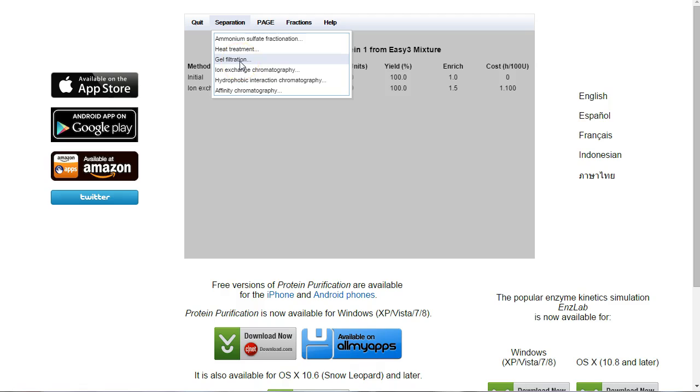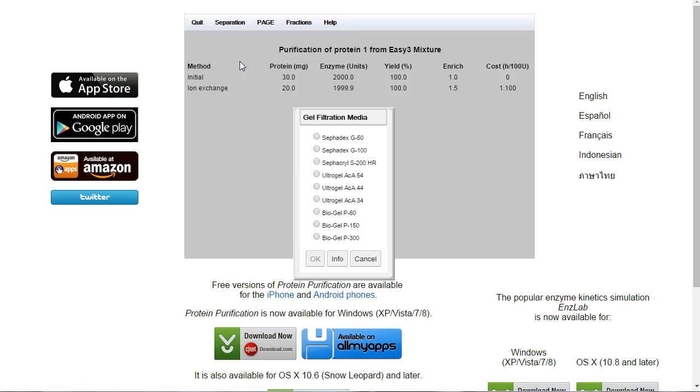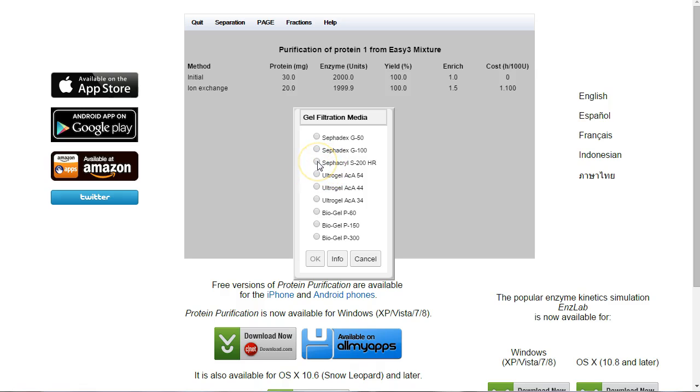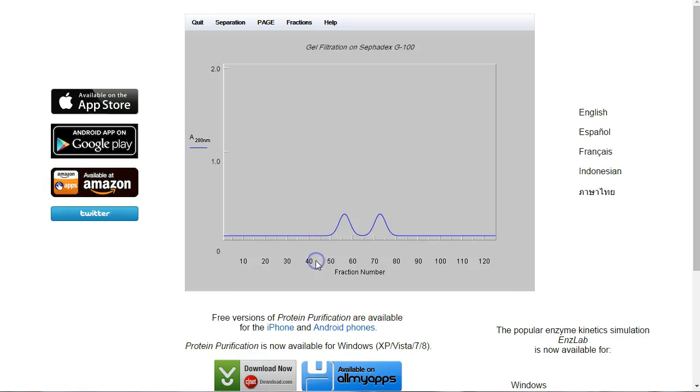Gel filtration separates on the basis of size. We need to pick one of these matrices to use. I know Sephacryl S200 is going to work. These ones all here will work. So let's pick G100. And we'll click OK.